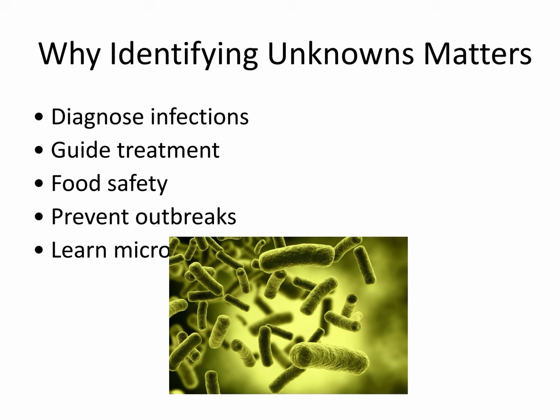Correctly identifying unknown microorganisms is an important part of microbiology because in healthcare, identifying bacteria allows providers to diagnose infections and choose the correct treatment. It can also help with food safety, preventing outbreaks, and we can learn how to identify techniques by using multiple tests, similar to the way we did with this.